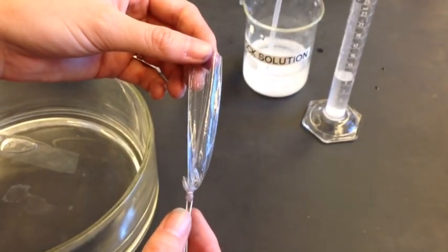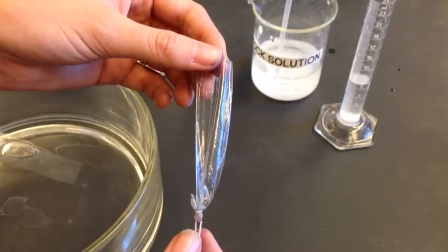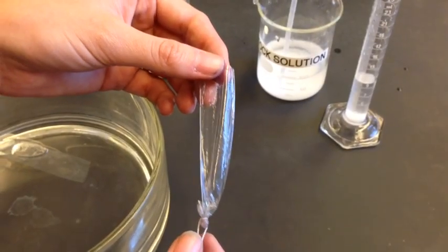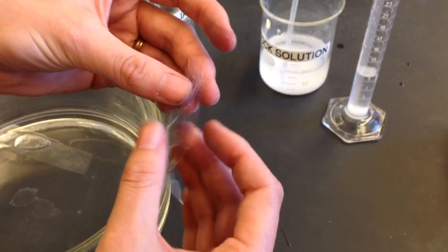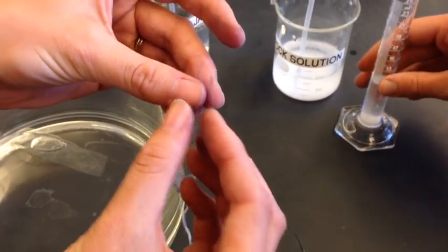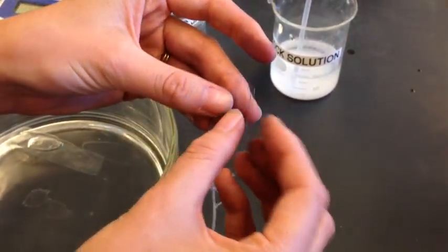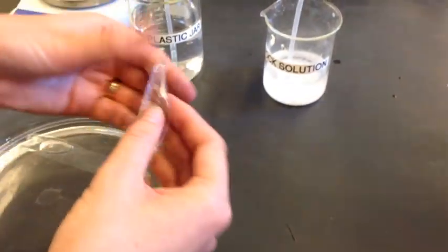Now that one end of your dialysis bag is sealed off, you need to get the stock solution inside. The best way is to open the bag by rubbing it open. If you're having trouble, you can re-wet it and work with it again.